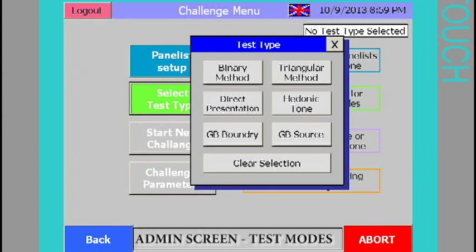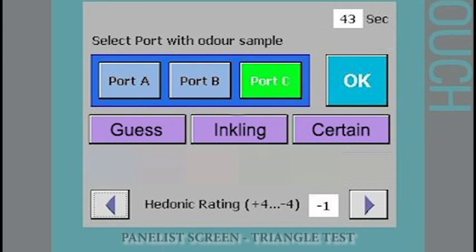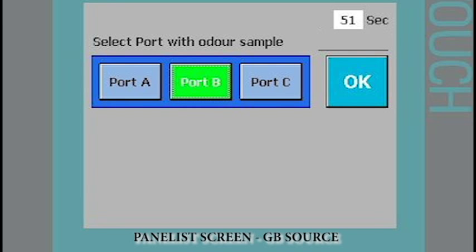The SC300 can perform a variety of test modes including binary, triangular, and hedonic tone. Other test modes including the Japanese and Chinese GB boundary and GB source modes are also possible with this international olfactometer.